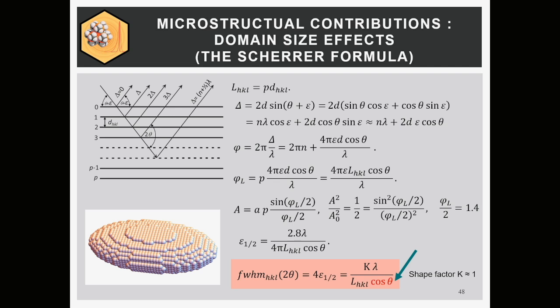Well, you all know the typical exam question, third or fourth semester. Of course, if you have, let's say, a little shift in the first plane, and you go lower, down, down, down to the next plane, then you find the plane deep in your crystal where actually the phase shift between the first and this one is exactly pi. It means it's extinct. And then the next one and the next one down there is pi, pi, pi, so therefore you still have sharp peaks. But if this is not fulfilled anymore, if the crystal is too small in this direction, then of course you get the broadening.